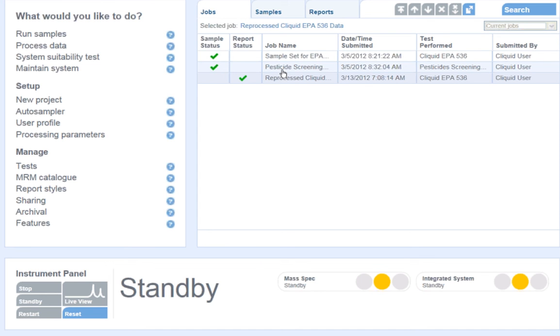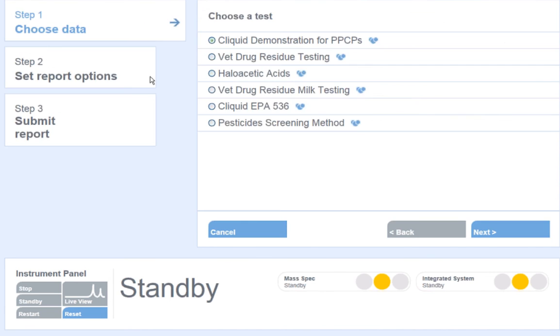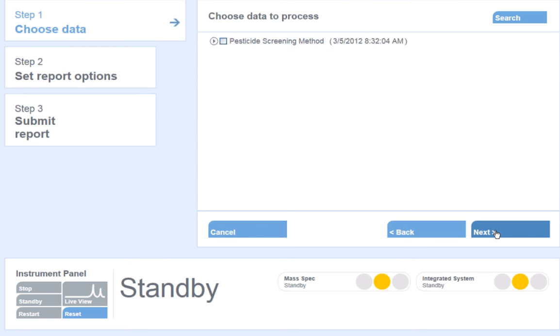To reprocess data in the qualitative workflow, please follow the following steps. Start by clicking process data, choose the test that was used to acquire the samples, and click Next.